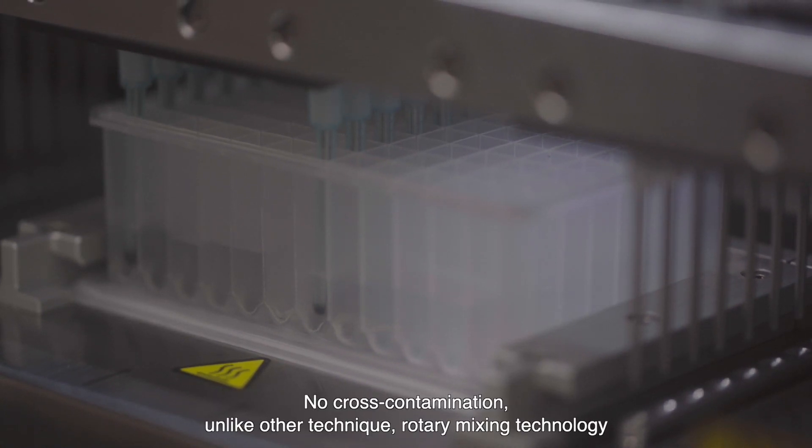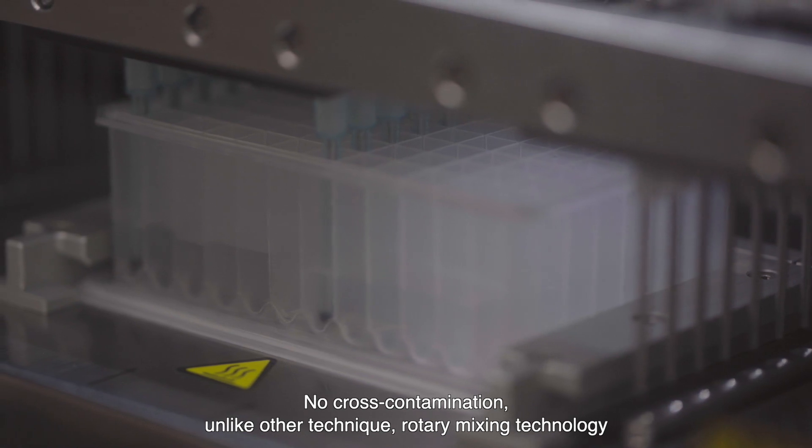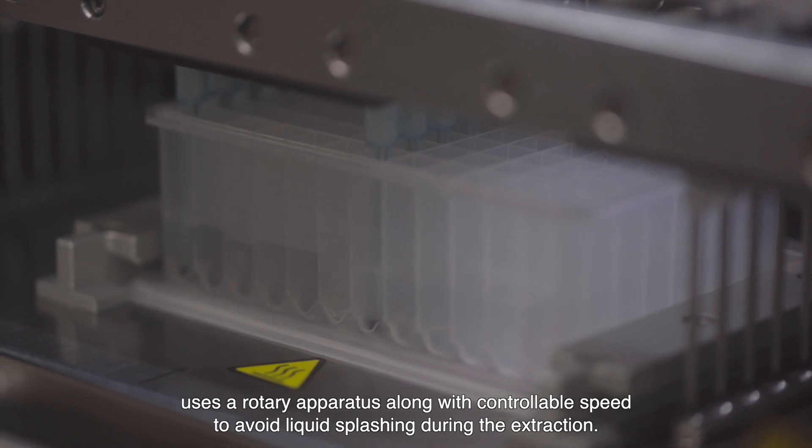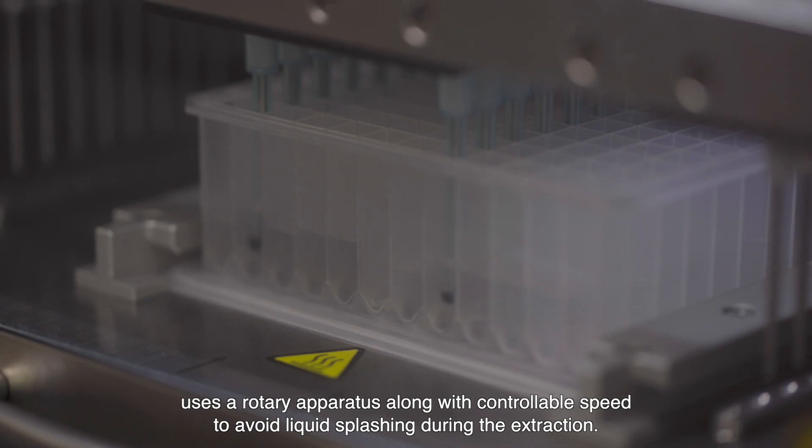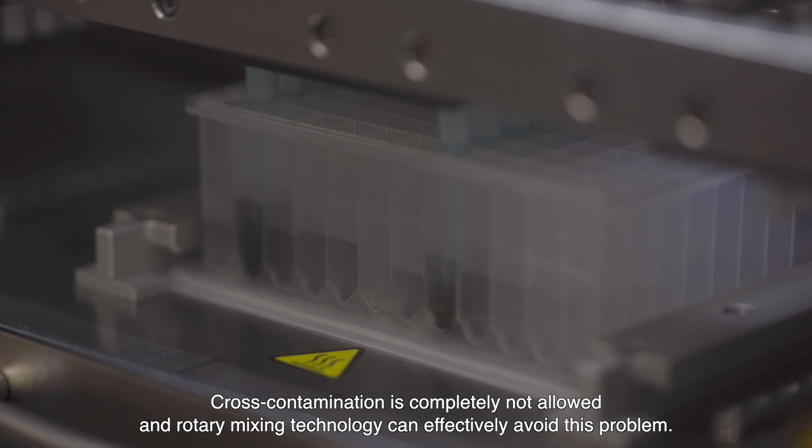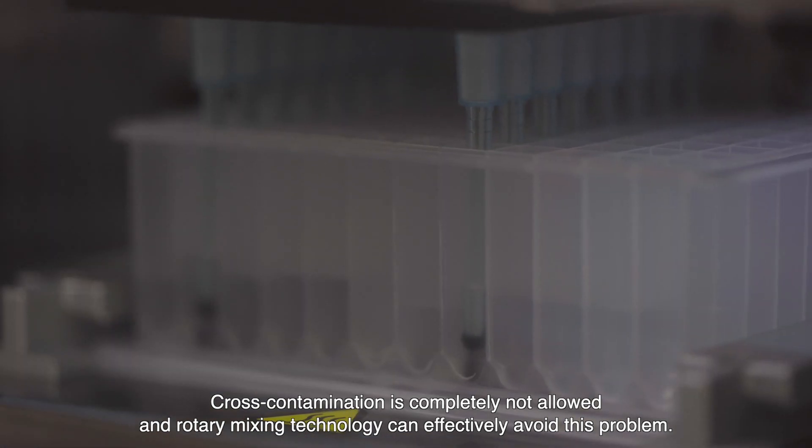No cross-contamination. Unlike other techniques, rotary mixing technology uses a rotary apparatus along with controllable speed to avoid liquid splashing during the extraction. Cross-contamination is completely not allowed and rotary mixing technology can effectively avoid this problem.